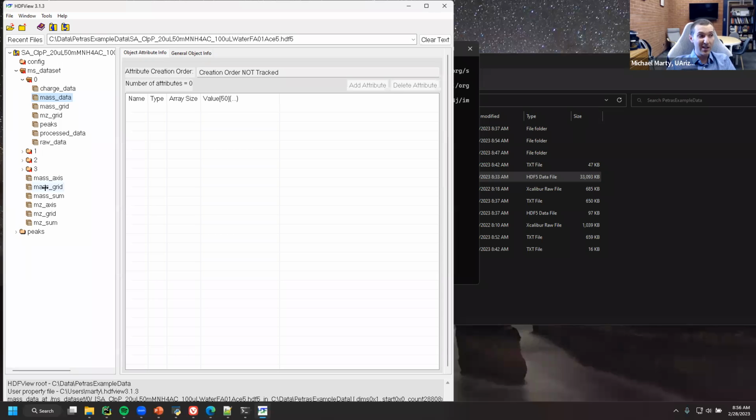So we could write a script to pretty easily convert this HDF5 file into an MZML. It would be like a deconvolved, zero charge mass versus time. That's a cool idea. You used to do that with Extract in Excalibur, but they somehow discontinued that. And in the new FreeStyle, Extract does not support that anymore. So I think that's a real niche. It would be awesome if you could fill that.